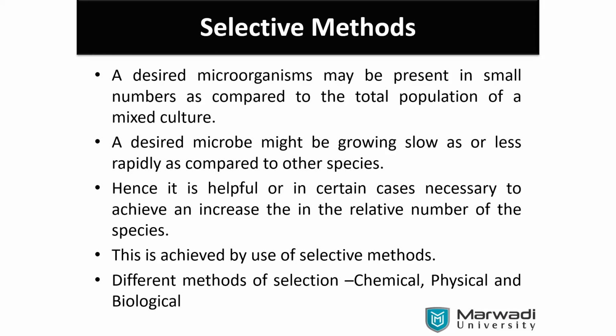Yes, here there are yellow pigmentations, red, green, as well as some black spots. If you are going to check it out from the outer part, don't open it, just keep it in a tilted position. Looking from above, you will find some are raised. Okay, it's like a mountain range.